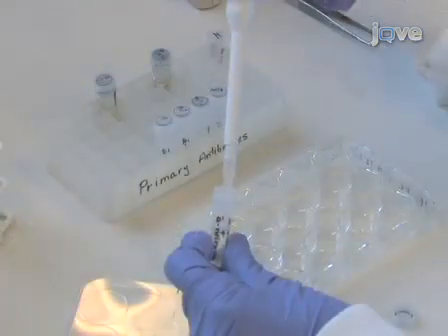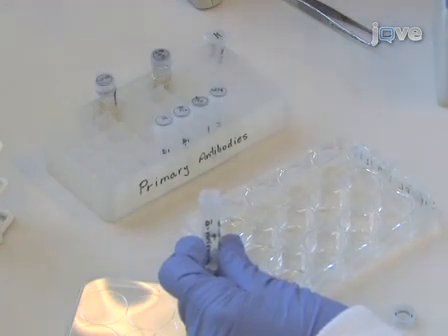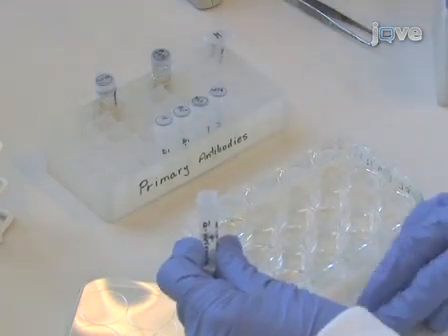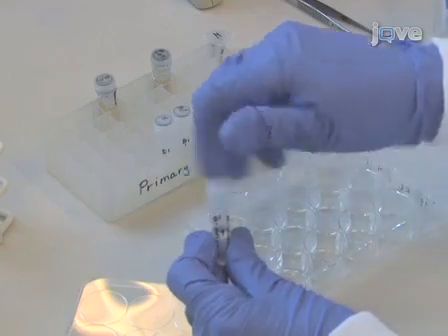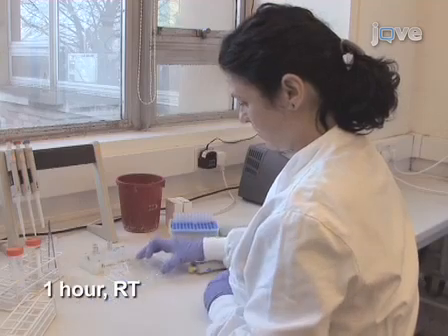Add the primary antibodies against bacteria and α-actinin simultaneously. 80 to 100 microliters of antibody per cover slip is sufficient if added carefully to cover the surface of the cover slip. Incubate for 1 hour at room temperature.